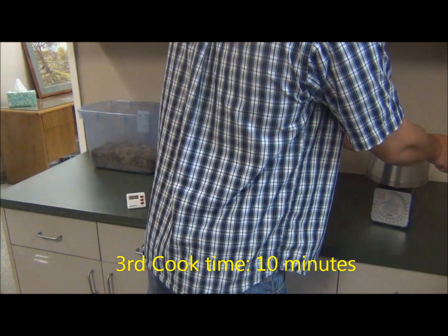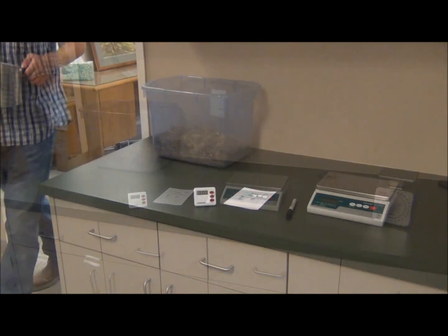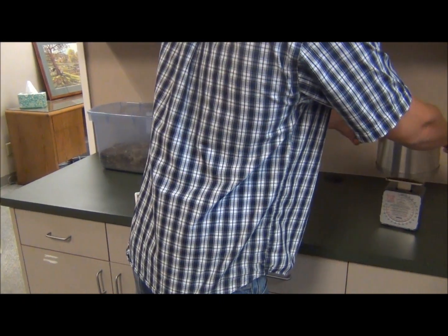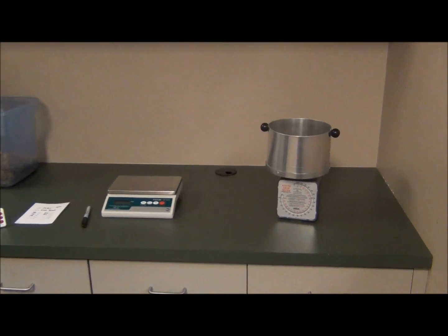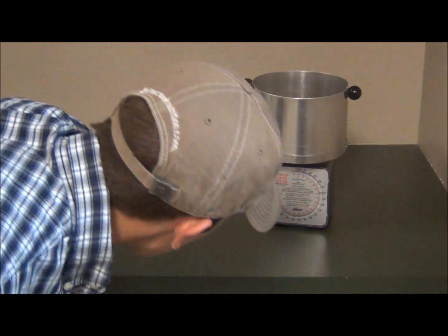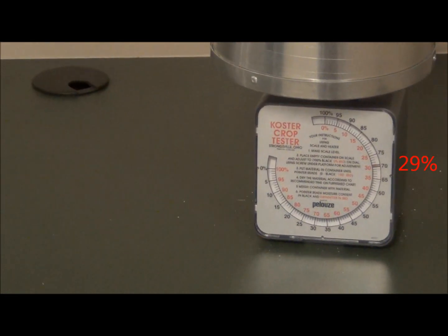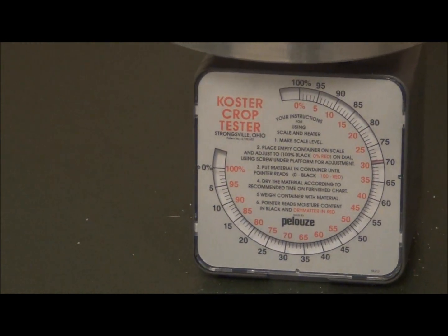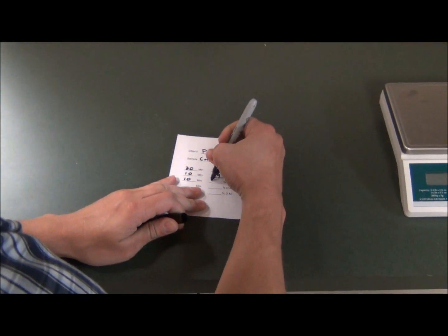Place the specimen container back on the evaporator for a third cook. The third cook time, as the second, will be a 10 minute interval. Repeat this process until there is no change in the dry matter measurement. Once the third cook of 10 minutes is completed, in this demonstration equaling 29% dry matter, no further test or cooking is needed.